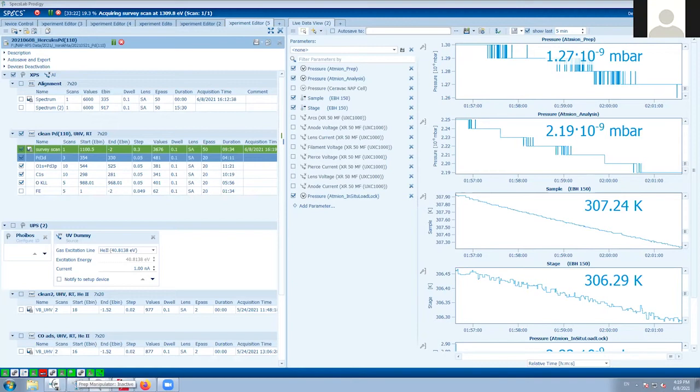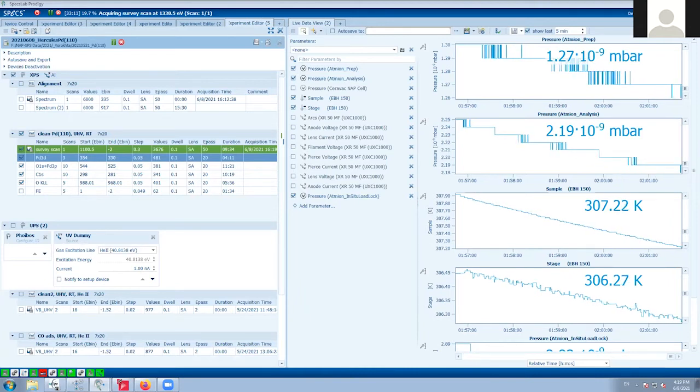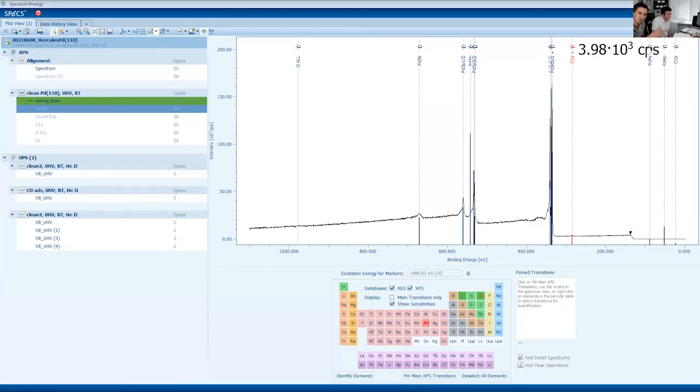Just one question. When you have the final spectrum, when you set a low dwell time but have many scans, can you actually save individual scans, or are they all added automatically? Is it possible to extract each individual scan?